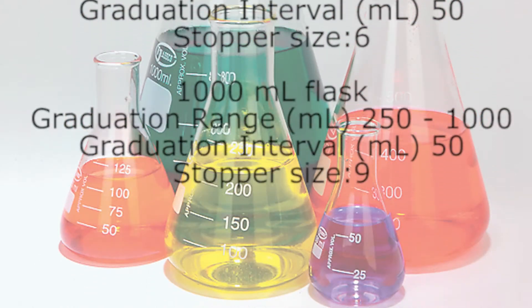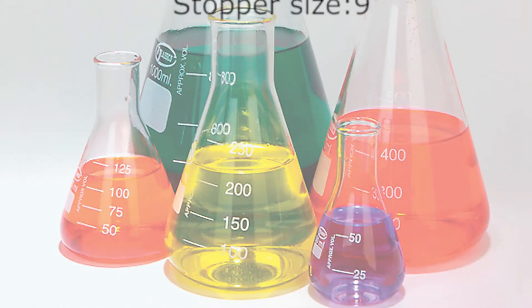These are the first three flasks shown here.